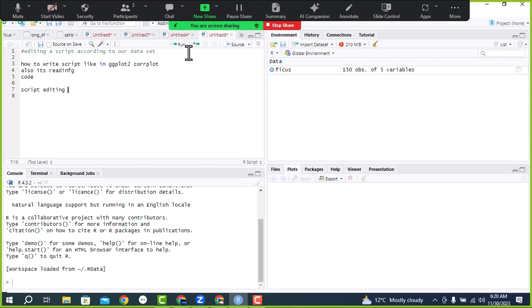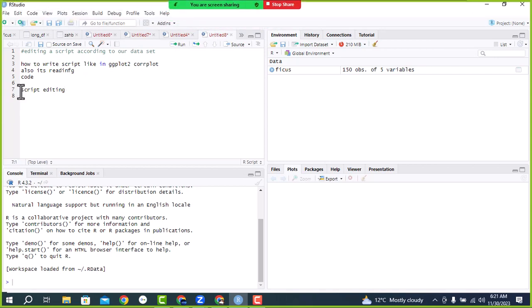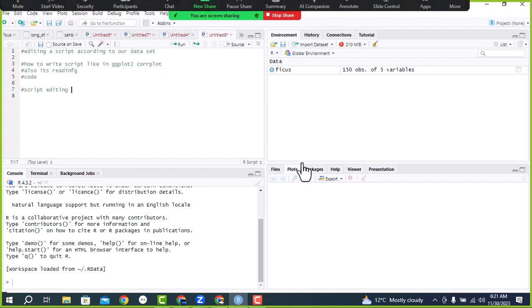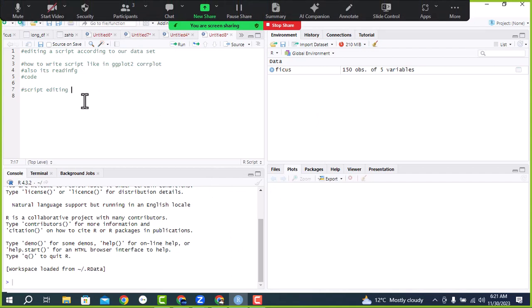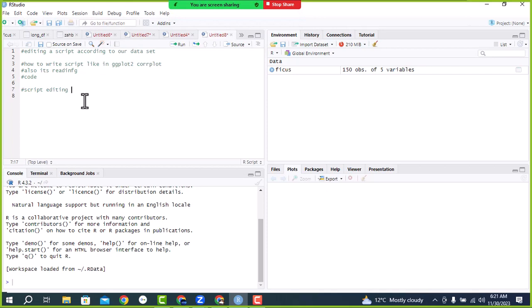Today our topic is script editing. Although we will practice different analyses, our main focus will be on script editing. For script editing, it means you already have a script, or your friend created a script for any analysis, and you want to do a similar analysis on your own dataset. Then you can apply editing skills. Editing is very important for data analysis and programming. For editing, we must have a sample script so that we can change it according to our need.